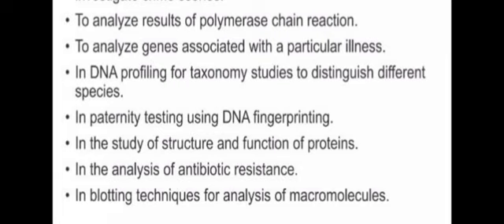Next, it is also useful for the detection of protein expression, purification, protein analysis, meaning cell protein expression. Other techniques we use are such as Western blotting, 2D gel electrophoresis, etc. These are the applications involving gel electrophoresis.